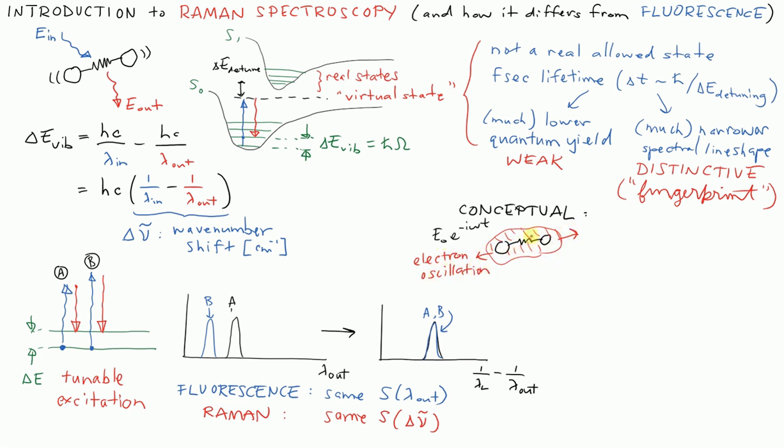And if the molecule weren't vibrating at all, if the atoms were staying in their place and not changing their separation from each other, we'd say there's no vibrational motion. And we would say that there's an induced dipole moment. The polarization, the separation of the positive charge center from the negative charge center, we would refer to as an induced dipole.